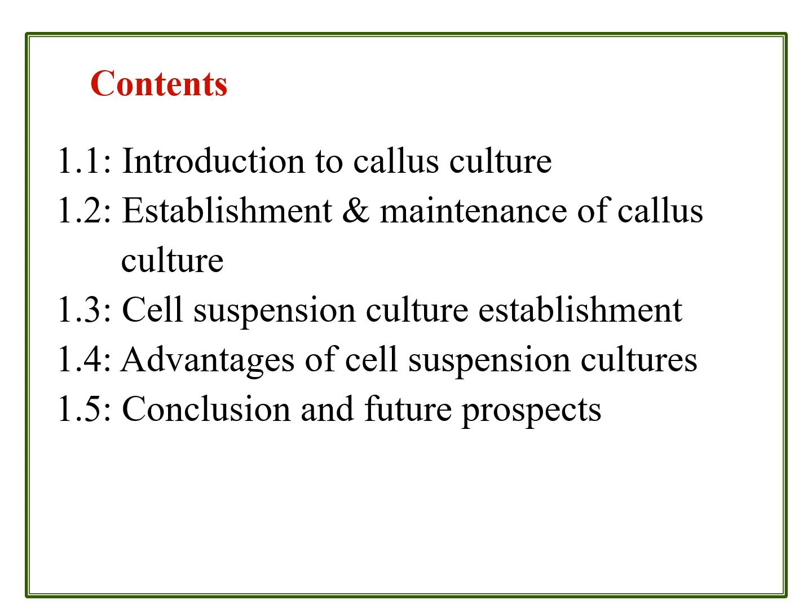And the next concept is establishment and maintenance of callus culture. So this is a wonderful area where, in case of plant tissue culture, once you establish the callus, you can indefinitely get the products, a wonderful application to the field of agriculture.